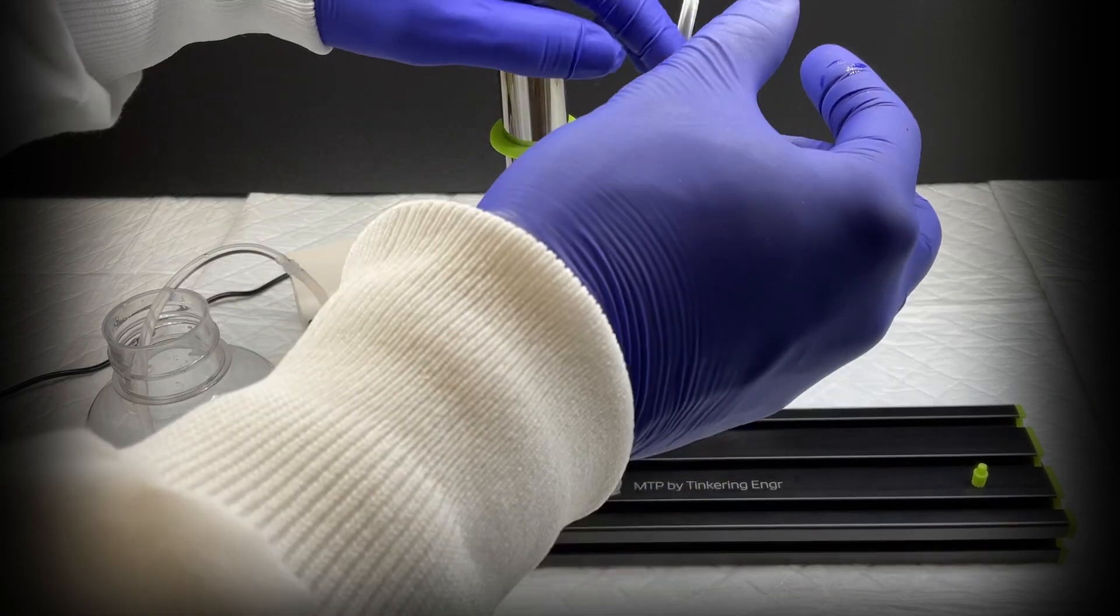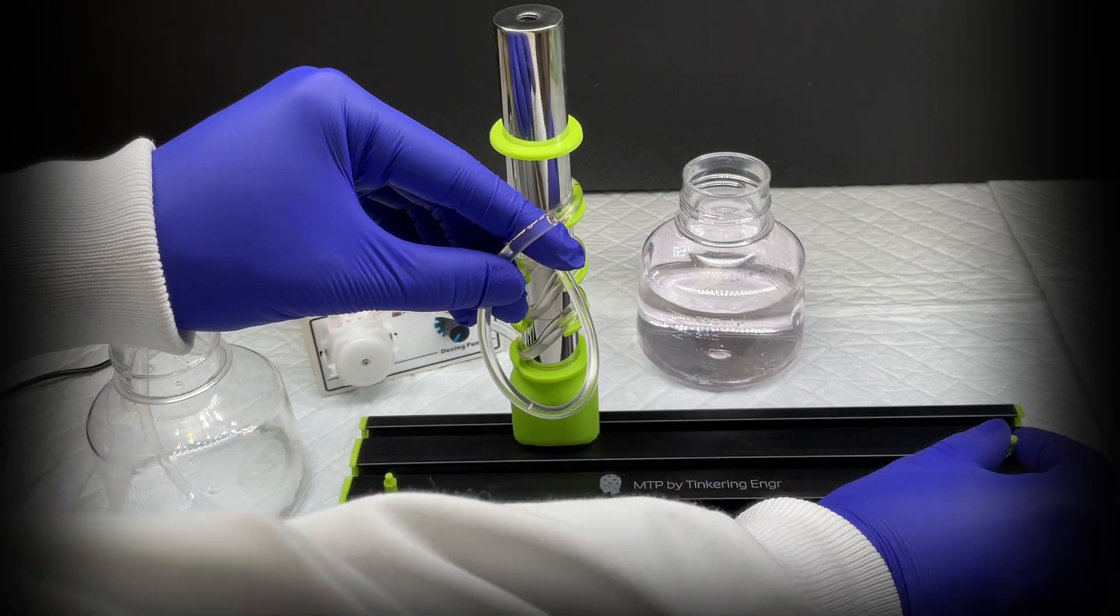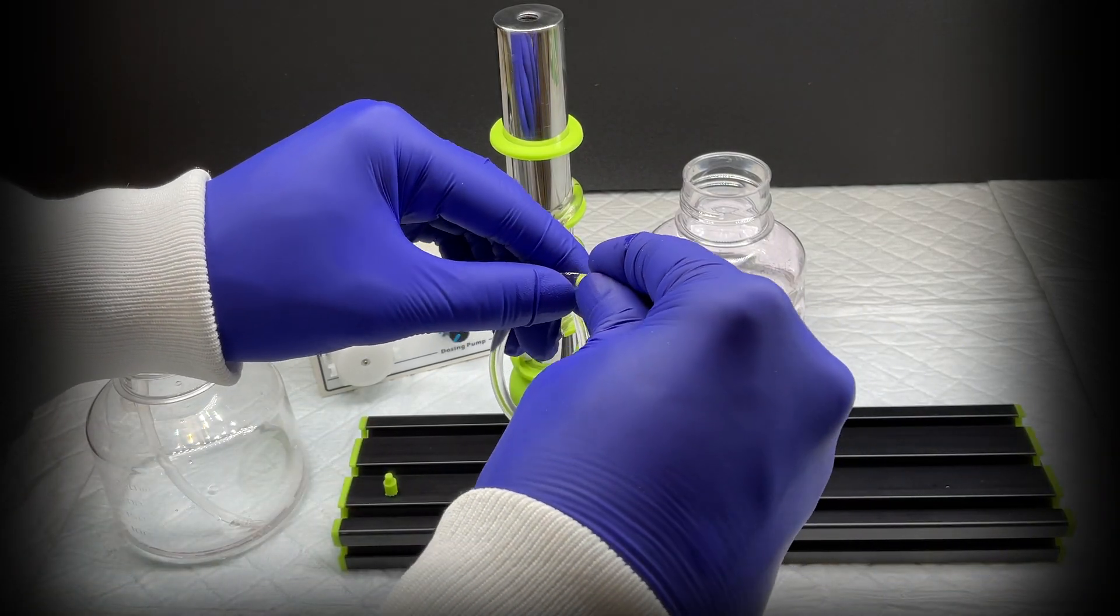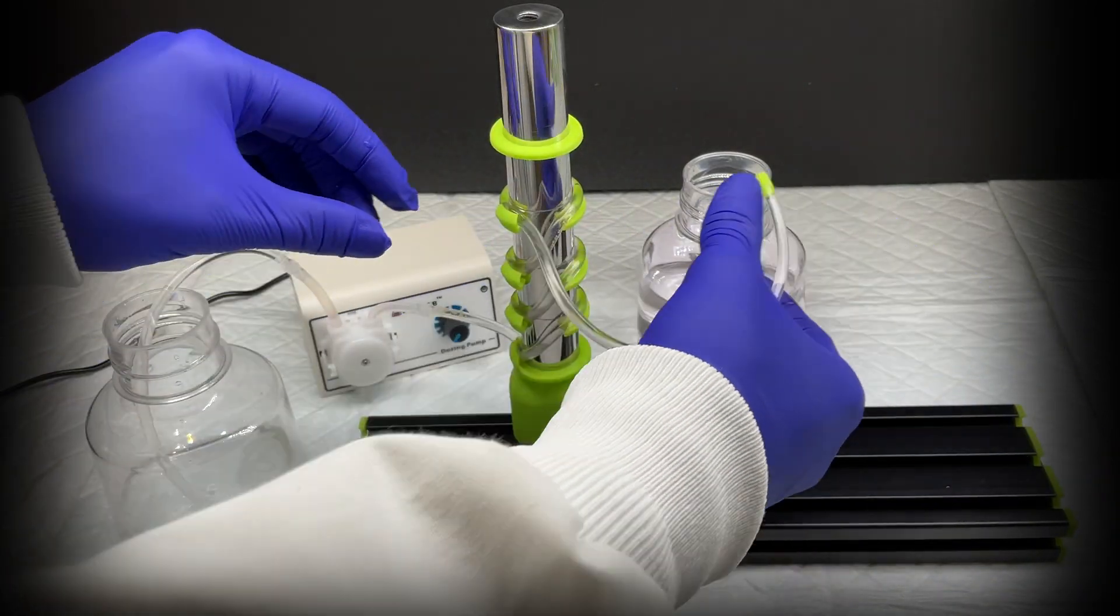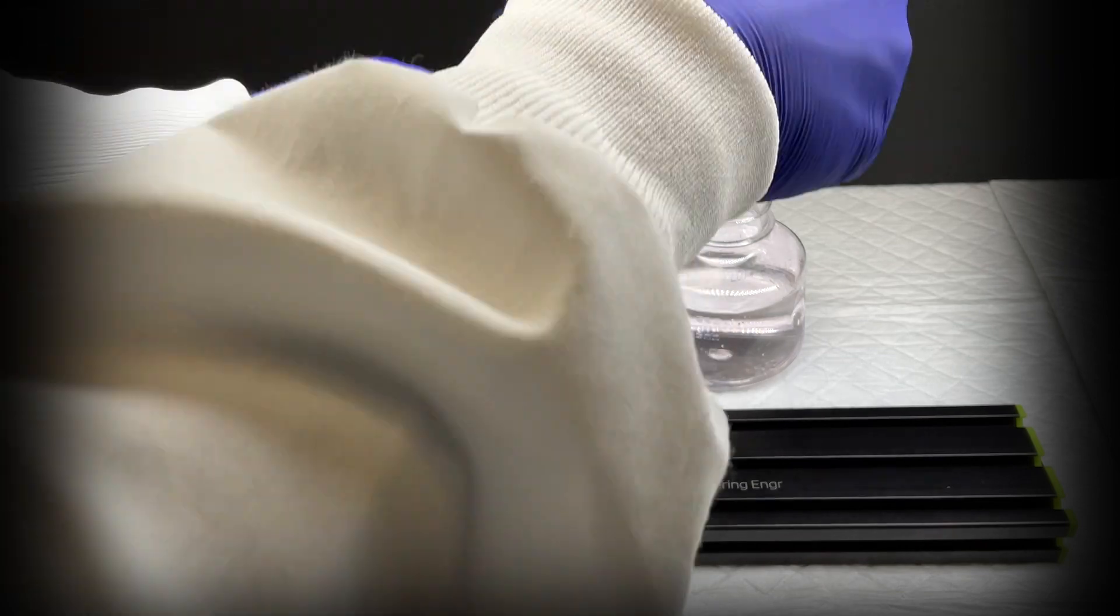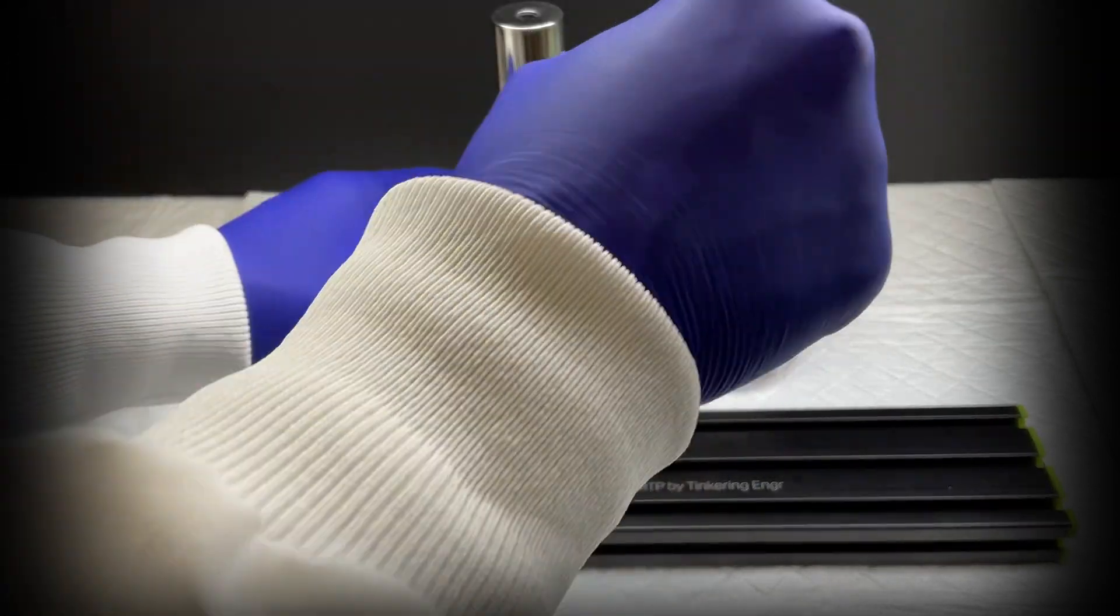With the magnetic resin trapped in the tubing, we now need to reduce the volume of the tubing to a desired elution volume, commonly in the microliter range. Using 3D printed stoppers, we can cap both ends of the tubing and unwind the tubing from the apparatus.